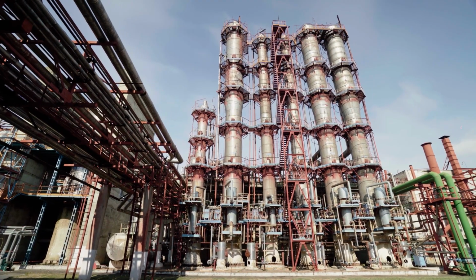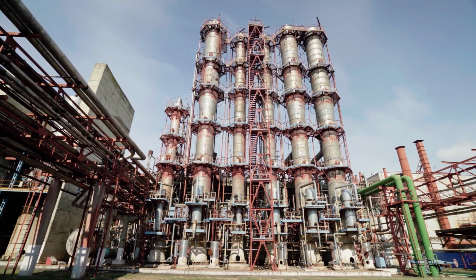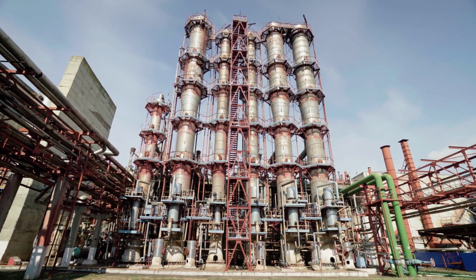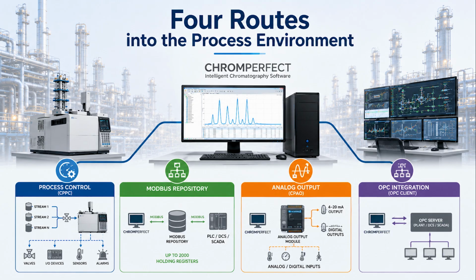A chromatograph may need to analyze several sample streams, operate continuously, respond to plant conditions, trigger alarms, communicate with a PLC or SCADA system, and return results in a form that can be used by the wider process. Chromperfect includes a number of specialized modules designed to connect chromatography with these process-focused workflows.